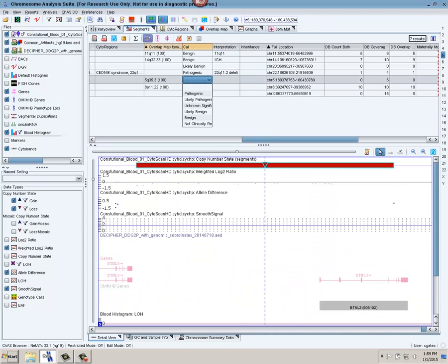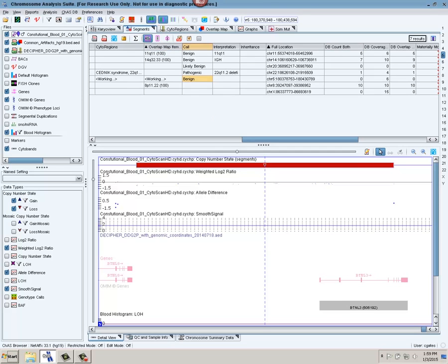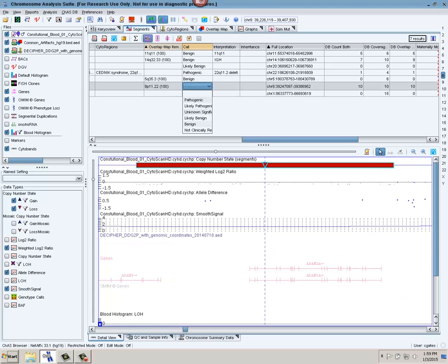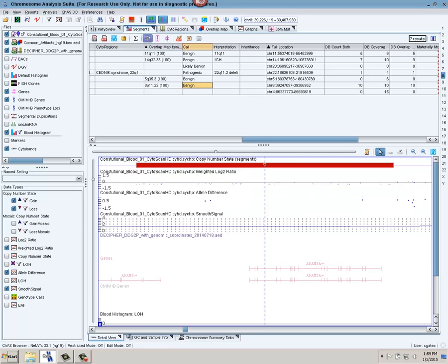Again, I have my overlap map. I haven't seen it before, but I am 100% overlapping a region that I've seen previously, or have known to be artifactual. And same with this region on 8p. So I can call those benign as well.